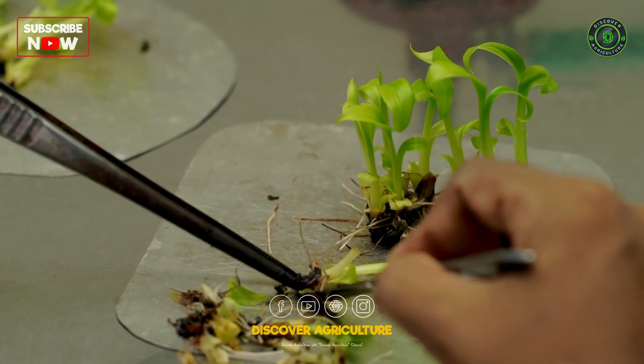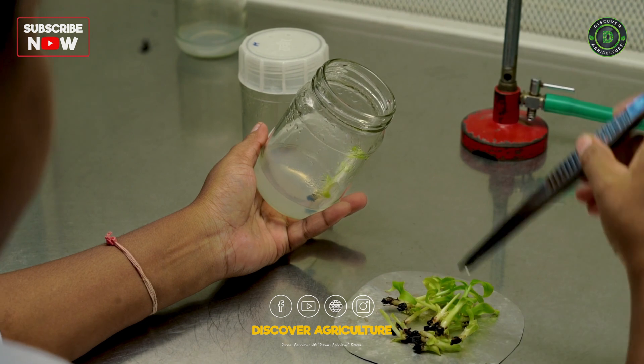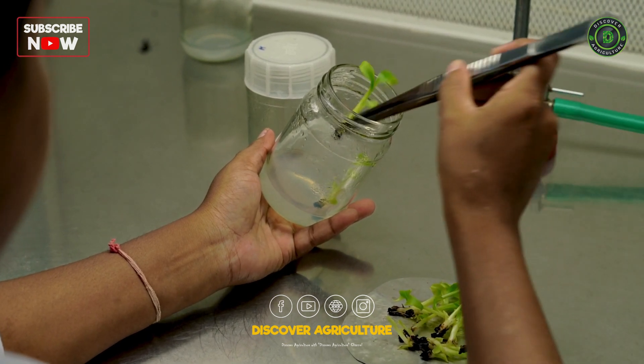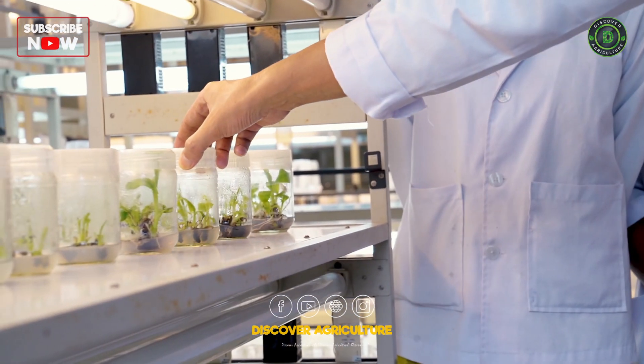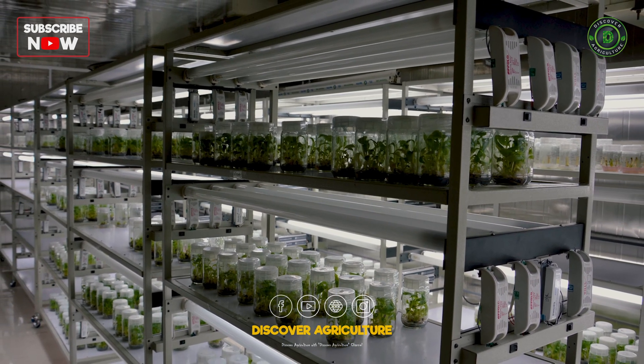Stage 3: Root proliferation. Once the shoots are about 5 cm tall, they are transferred to rooting media to develop roots. After 24-30 days, these plants are ready for further subcultures or transplantation.